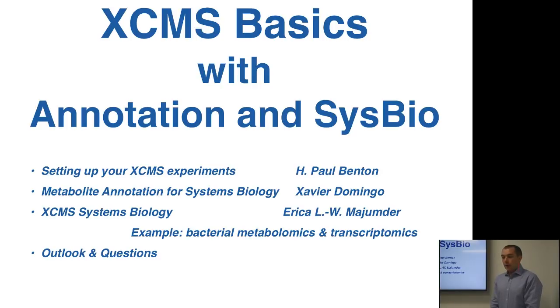And then we're going to move on to Erica at the final part of our talk, who's going to talk about XCMS systems biology. Erica has recently joined our lab and has made quite an impression as she's jumped on in. So without further ado, I'm going to jump into setting up our XCMS experiments.